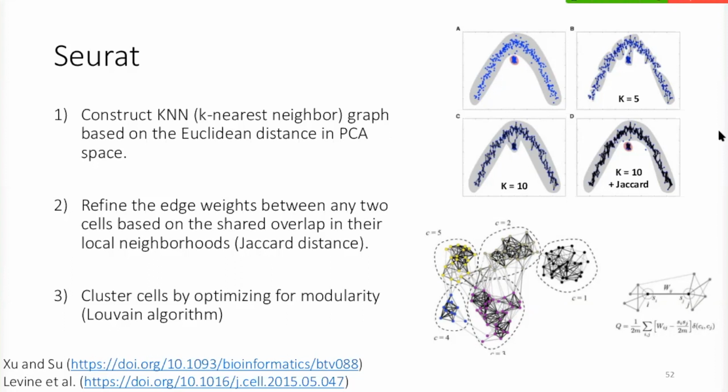So what you can do with this Jaccard is that you can say, okay, I calculate the k equals 10, and then I refine this cluster using the Jaccard index. And the Jaccard index is how many shared neighbors there are between each pair of nodes. So in this graph, for instance, these 2 nodes here, I don't know if you can see that, do not share a lot of neighbors, right? So then I remove this one. While in this case, any pair of nodes within this small cluster will share many other neighbors as well, so I keep these, right? And then what you see here is that this resolves the true clustering of the data.